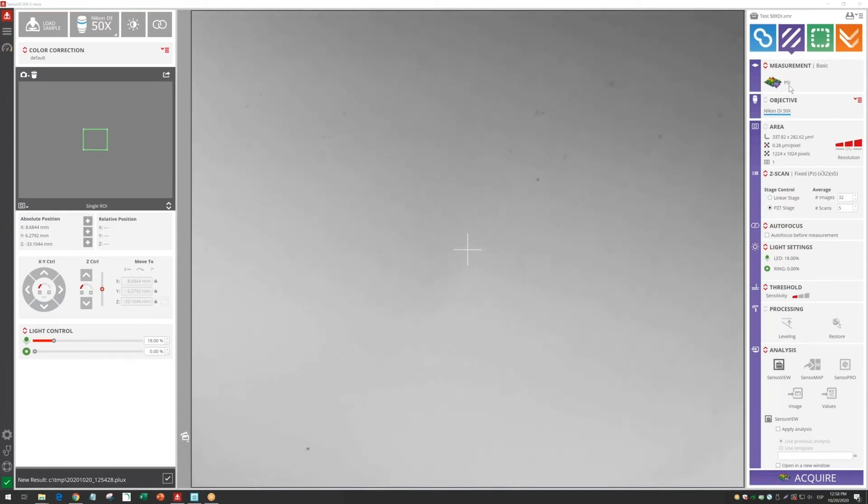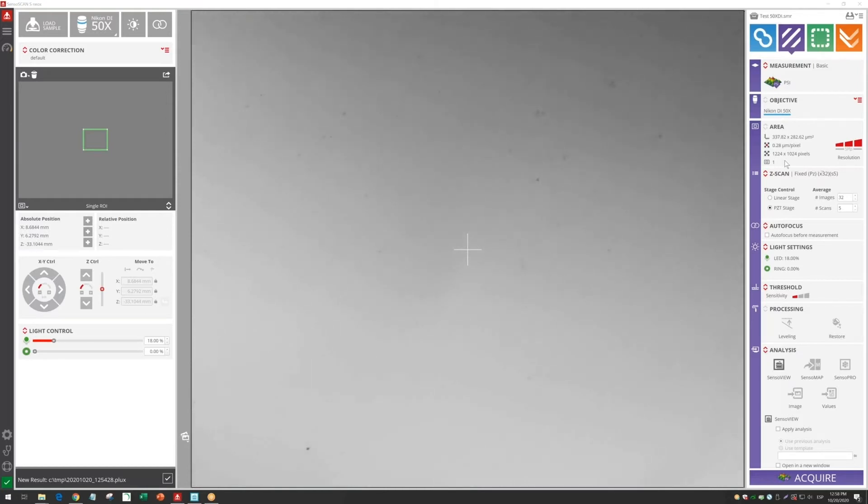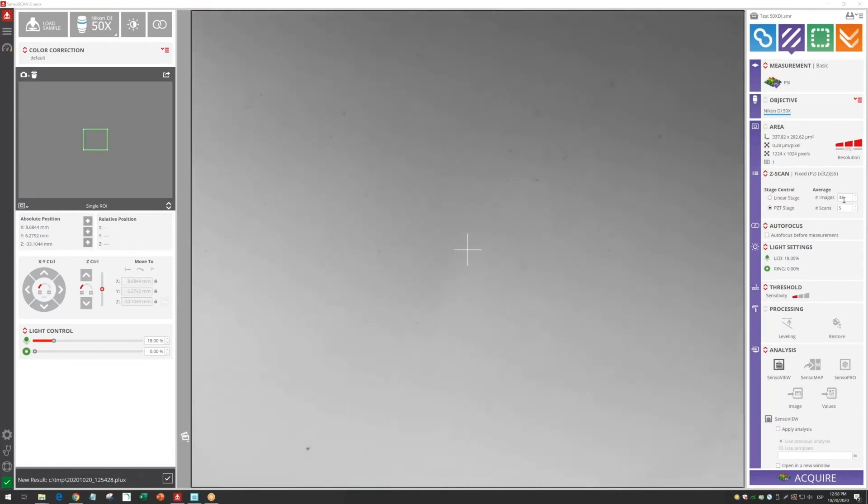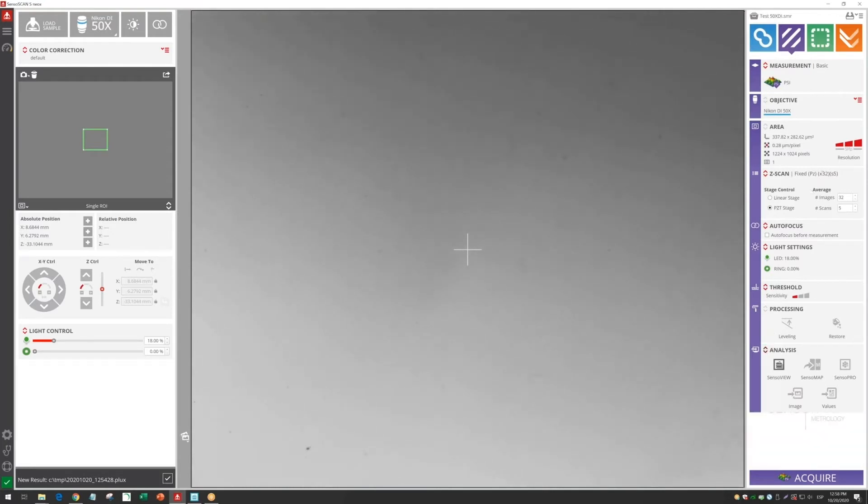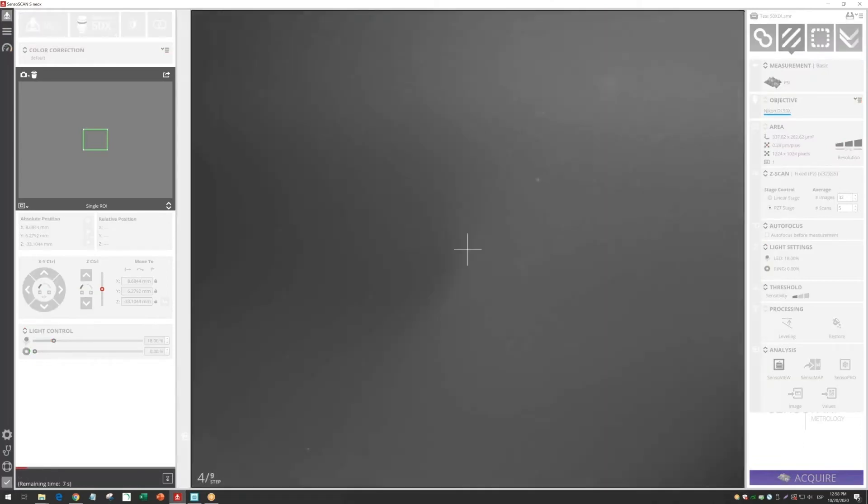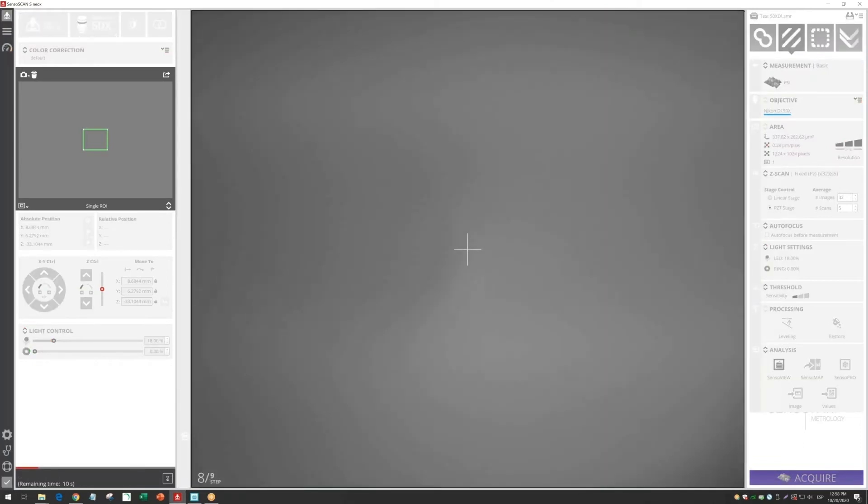In order to get maximum performance and to avoid noise from the environment, I'm going to take an average of 32 images, and I'm going to take 5 scans. The software is doing that automatically, so click acquire, and then we will wait for a few seconds.